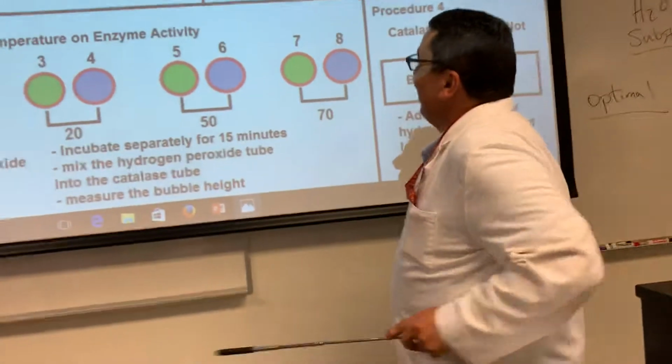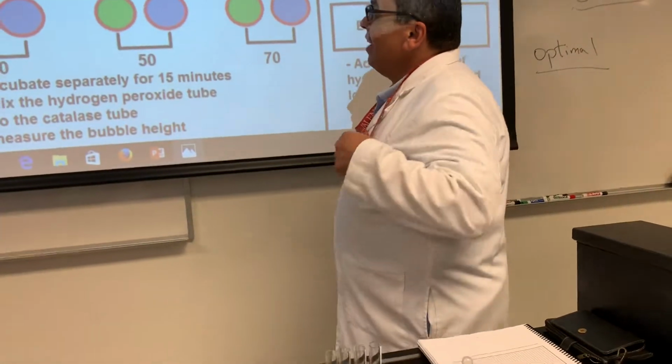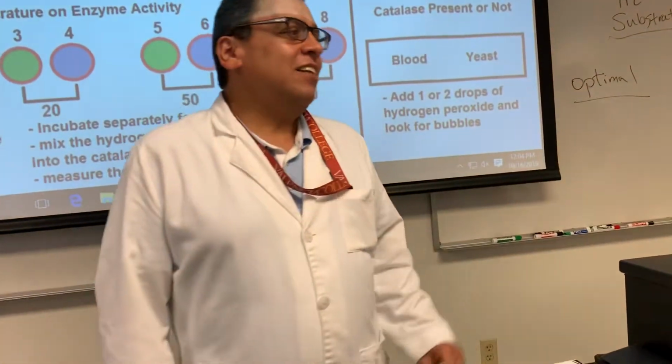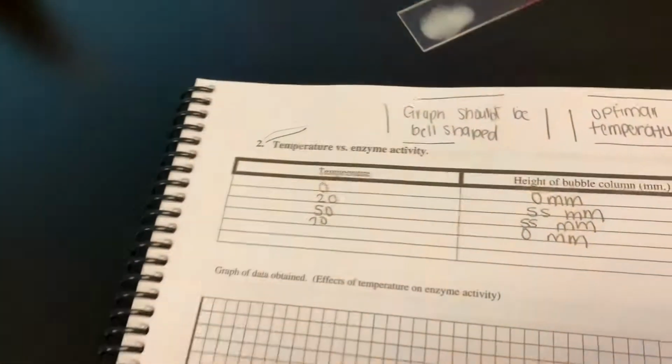All right. Good. So now we know that at 70 degrees Celsius, what happened to the enzyme? It denatured. Very good.